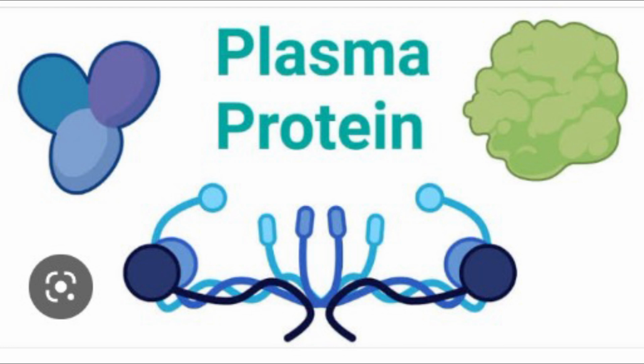Sulfur test. Sulfur containing amino acids like cysteine and cystine give a positive result to this test. Procedure: unknown sample 2 ml, add 40% NaOH, boil strongly, cool under tap water, then add a few drops of lead acetate and mix properly. A brown color appears if the solution contains sulfur containing amino acids.